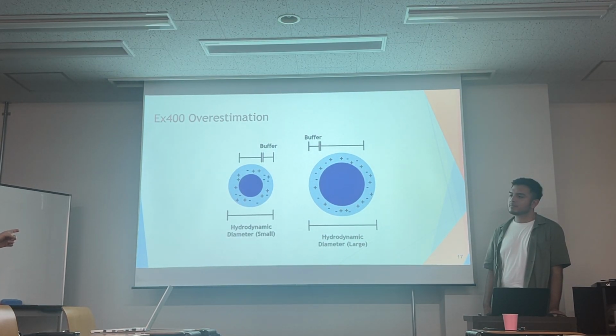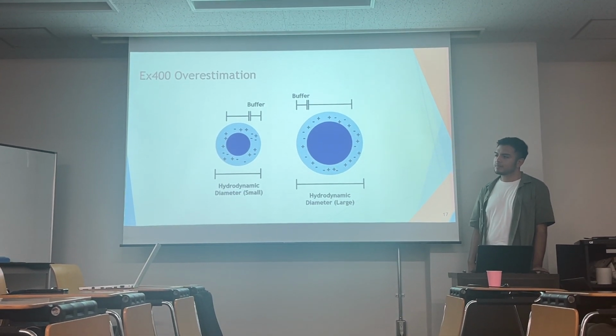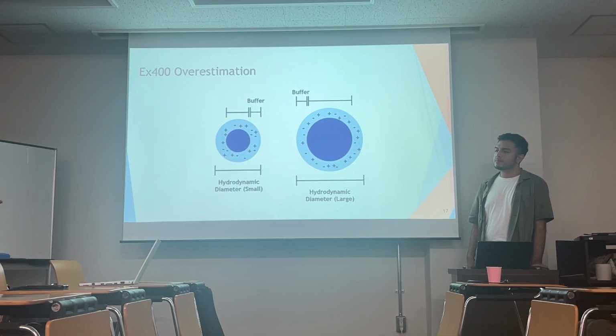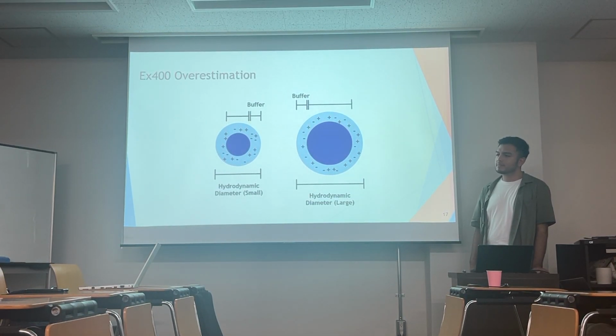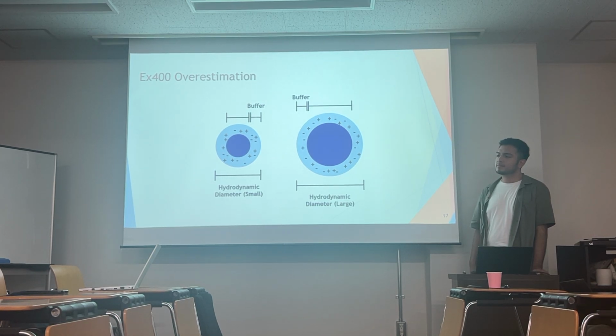Slip plane is, yes, on a solid surface, some aqueous water molecules are strongly attached. So it makes the apparent increase in the diameter.